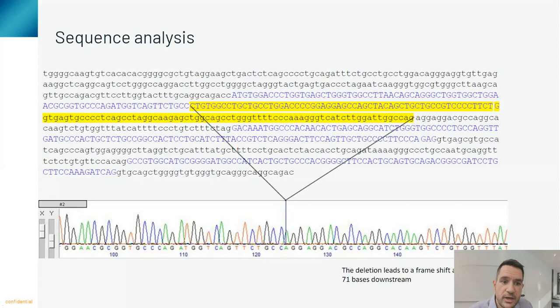This is a very easy and efficient way to screen for knockout clones and to generate knockout clones. By cutting out a part of the exon and fusing this part to the subsequent intron, you are normally generating a cryptic sequence that the cells can't interpret, and then the product undergoes nonsense-mediated decay. Or sometimes you are also generating a stop codon later on, which then leads to degradation.